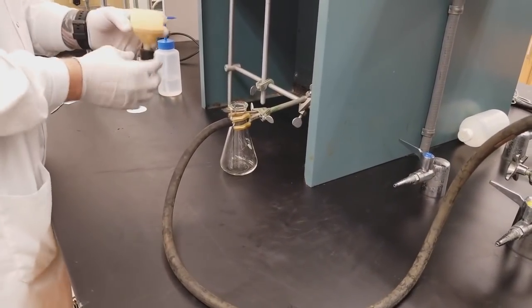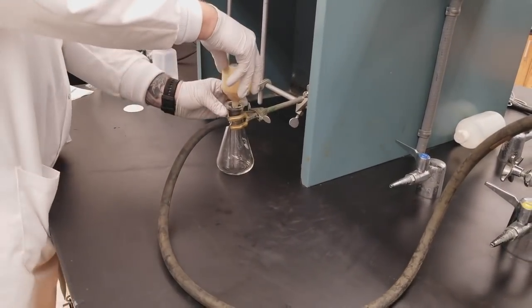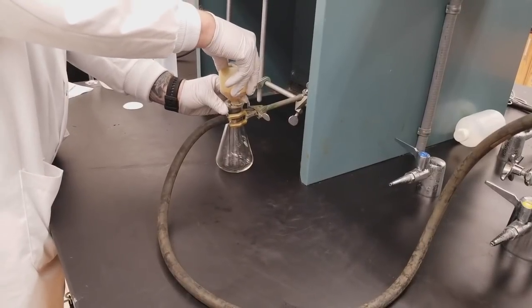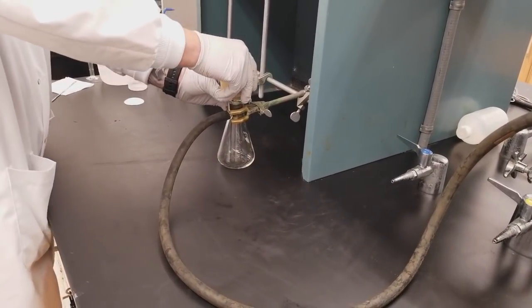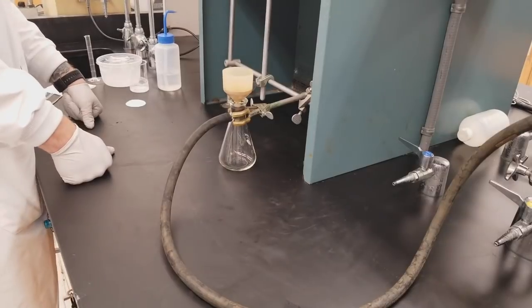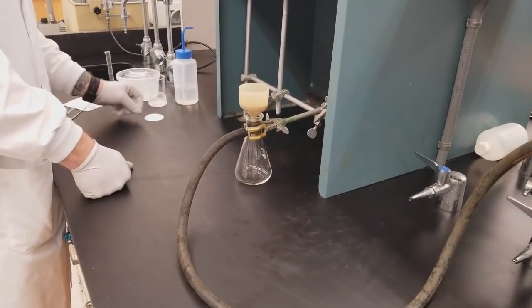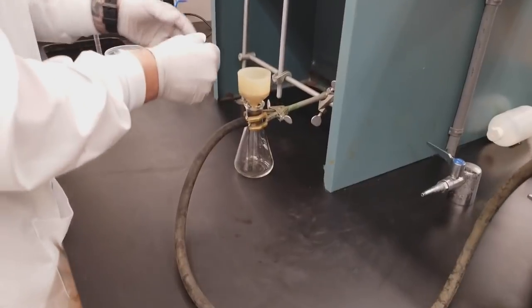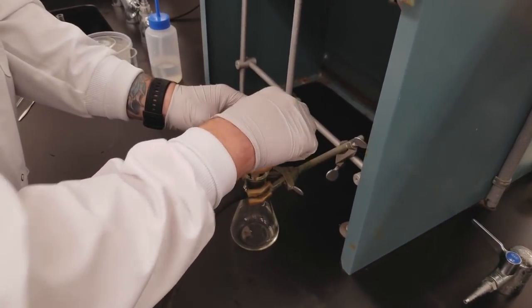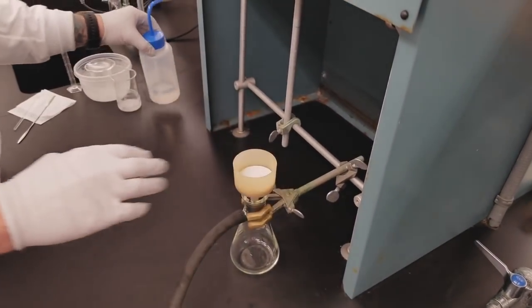So we'll take our Buchner funnel, make sure that we have that black vacuum adapter on there, put our Buchner funnel into our filtration flask and now we are ready to put our filter paper on top of the Buchner funnel. Just set that on top.